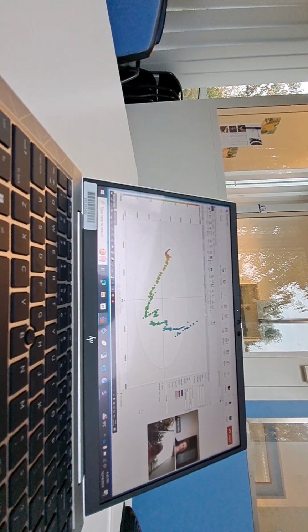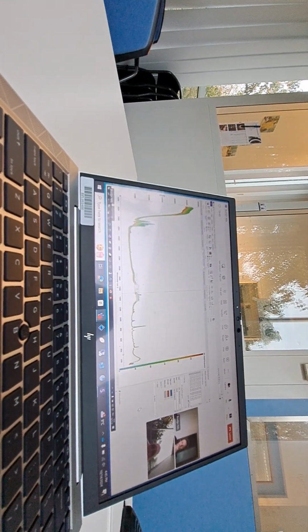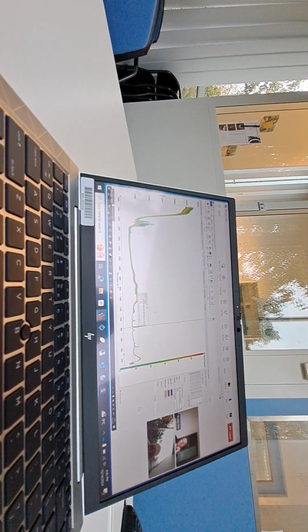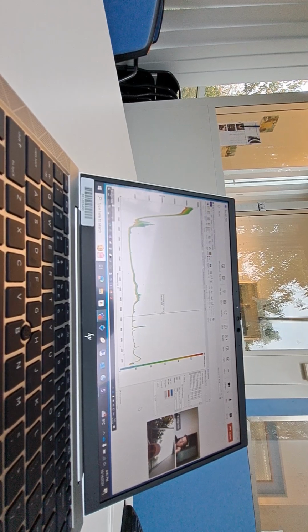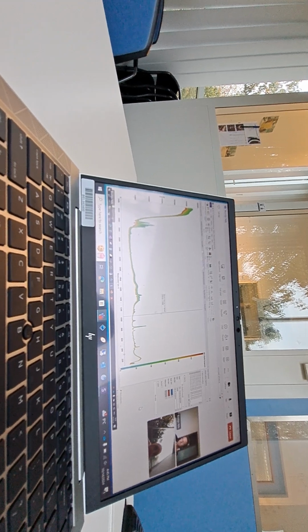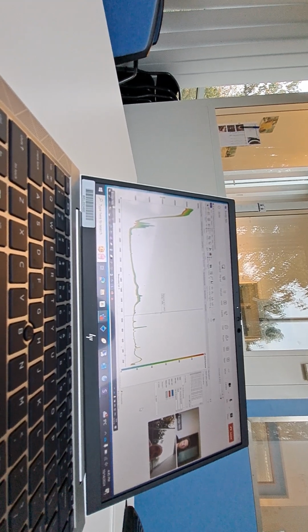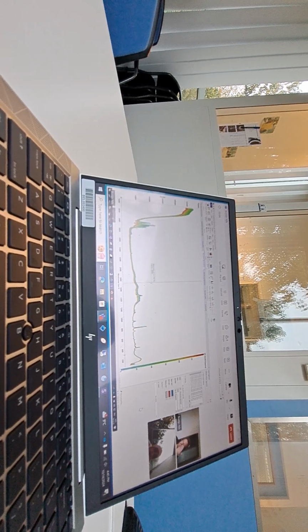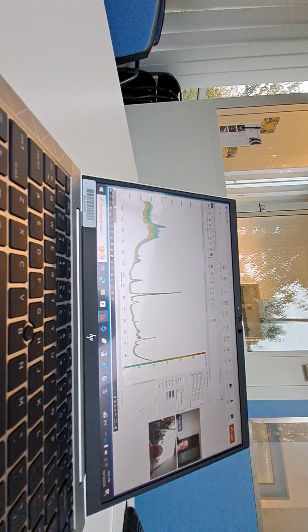Also, if you just look at the spectra, if you color according to your XRPD result, then you know, at this spectra, the XRPD shows me that I have already the free base, so I should be able to see it. And these spectra, stuff like this could be useful.